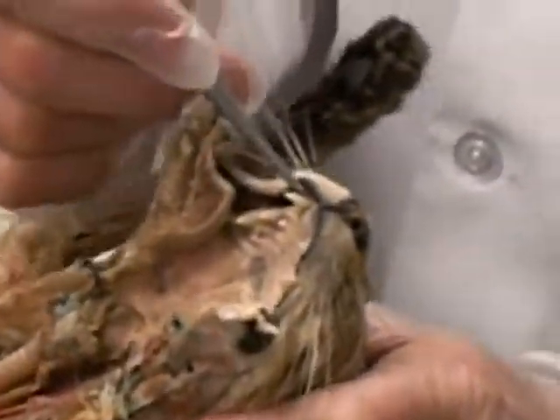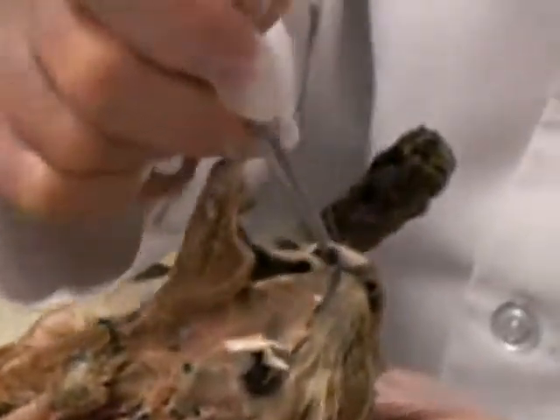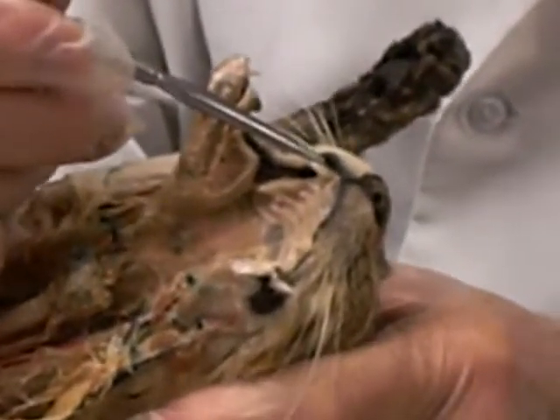Anyway, so, the vestibule. So that's a simple one. If I can't find anything good on the rabbit or the cat, I'll stick a pin in there.